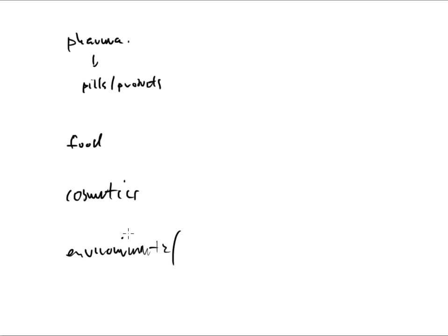So we are seeing LOD scattered throughout many different purposes, and that is why I call this a general purpose lab experiment. There's so many different industries that will use this test, and now, after today, you will know how to do it. So what does that mean to you? Folks, you need to start building a resume. That's what that means. And now on a resume, after today, you can say that you have general knowledge in loss on drying and put in parentheses LOD. That's all. Look, you already have learned something in the class.